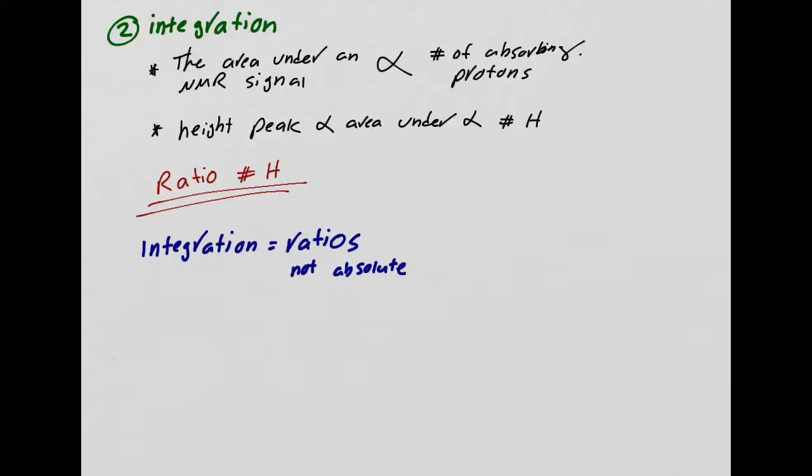And they're approximate, so sometimes you have to round up and down. And that gives you the ratio for number of hydrogen. So far, so good. Okay.